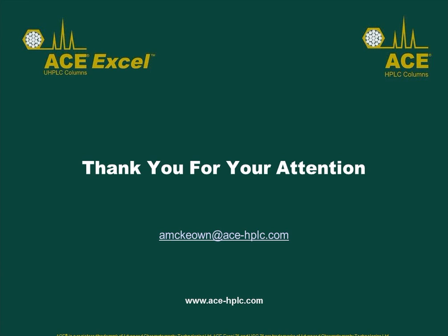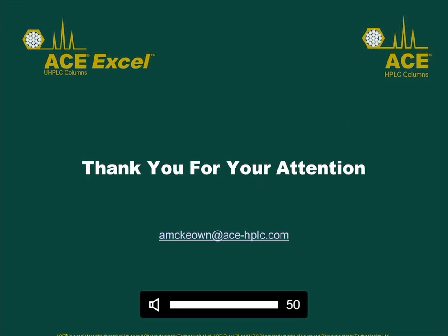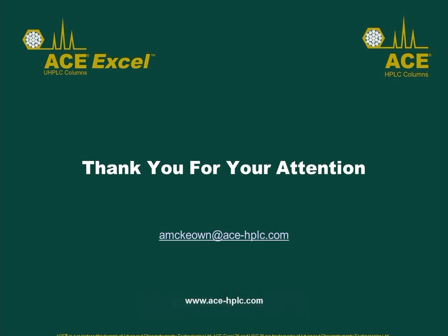So we've got a few questions in from the audience. I think you might have covered some of them, but it'd be good to go over them again. The first question is: you mentioned that contaminating metal ions in the silica can cause peak tailing. How does this work mechanistically? Is that known?